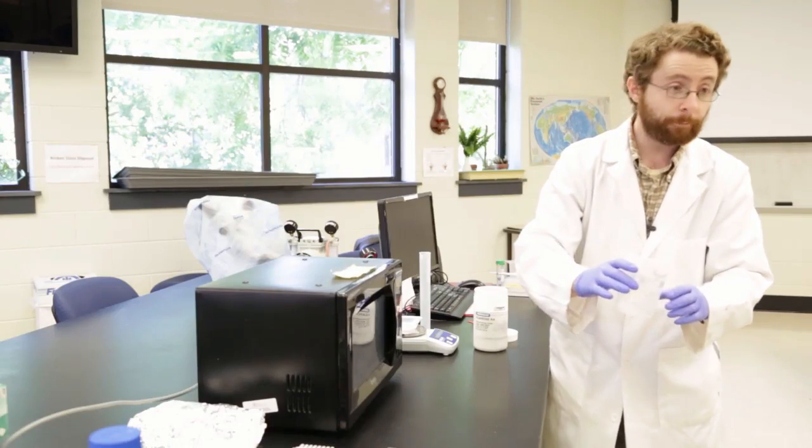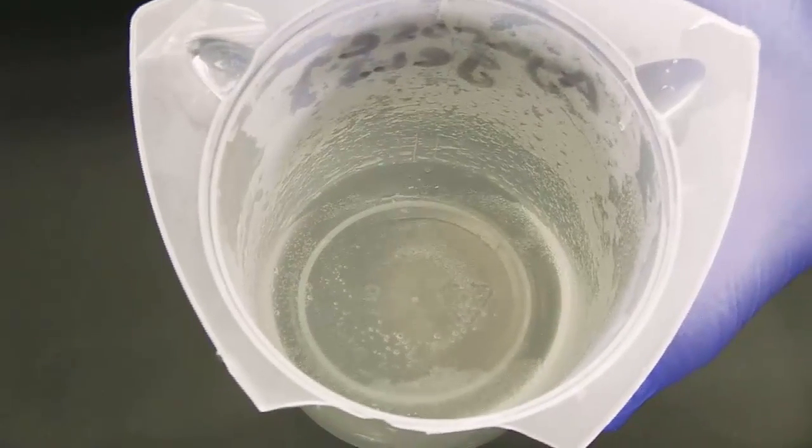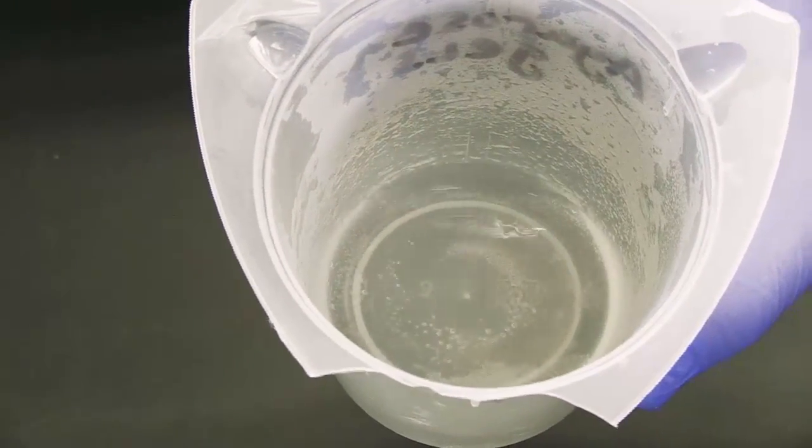So that has been a full minute, and now if you look after some of the smoke moves away, you can see that there is no more powder, hence all of the agarose is now dissolved in my buffer.